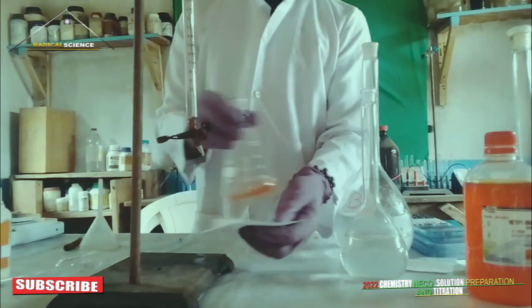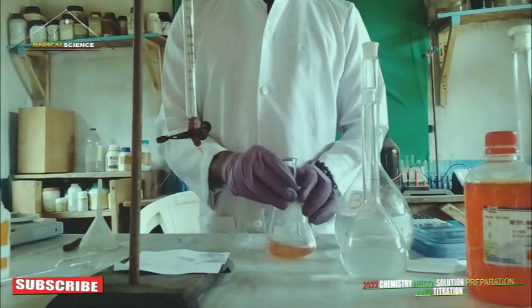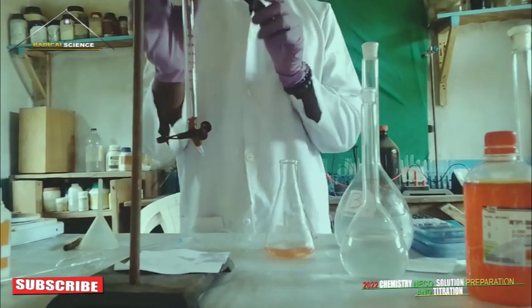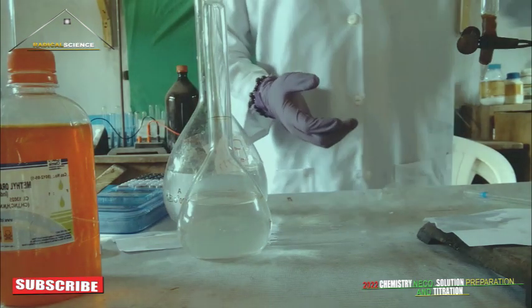Now it is time for us to take our reading. We have 14.0. So we have to pour this one away.